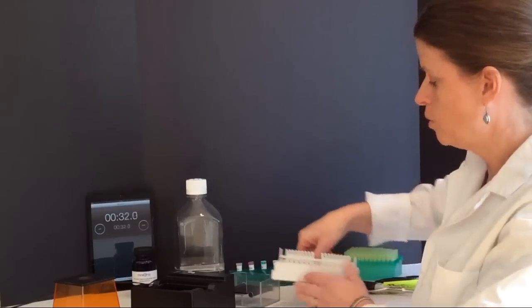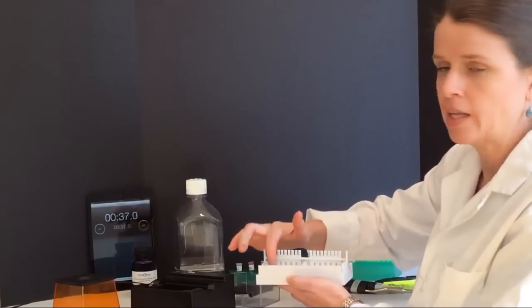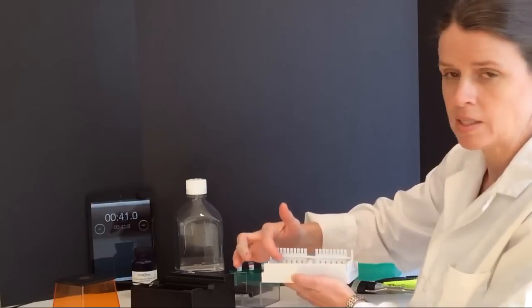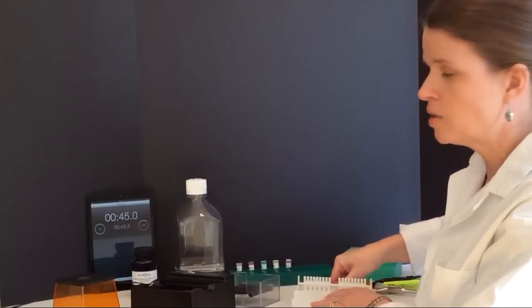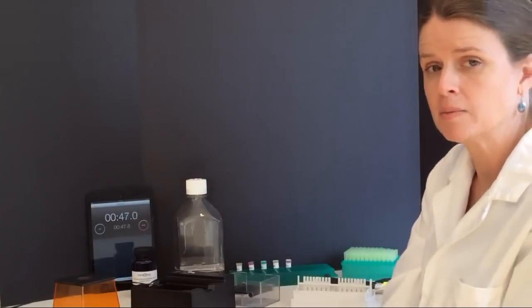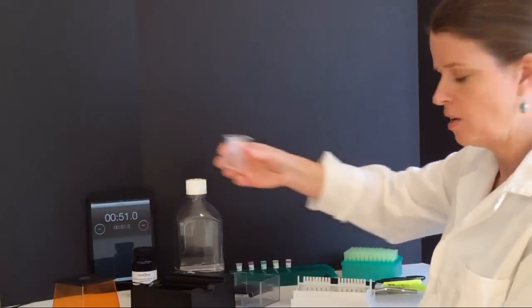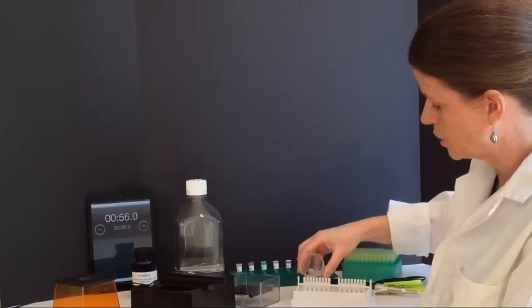To pour, we'll be using our casting tray that's included in our Mini One System. The casting tray allows you to pour two gels simultaneously and you can choose between six wells and nine wells. The gel cups take only approximately 20 seconds to microwave. Once they've been microwaved, you can simply swirl and pour into your casting tray.